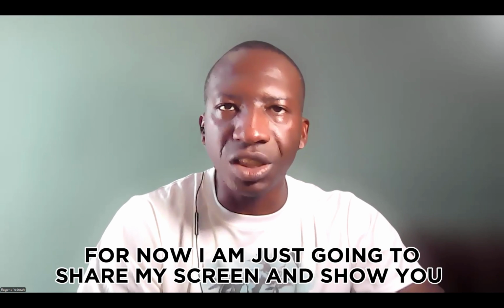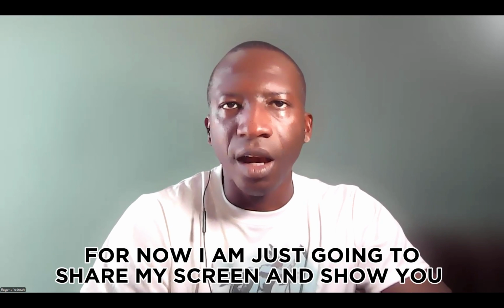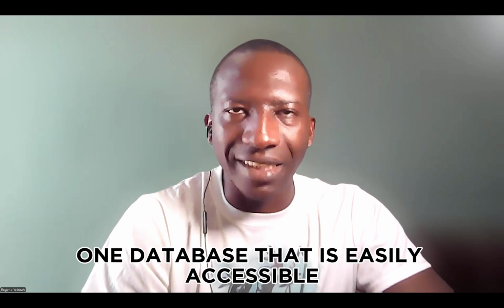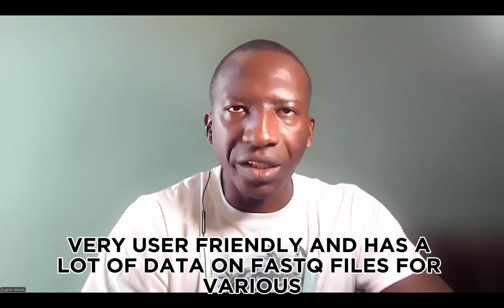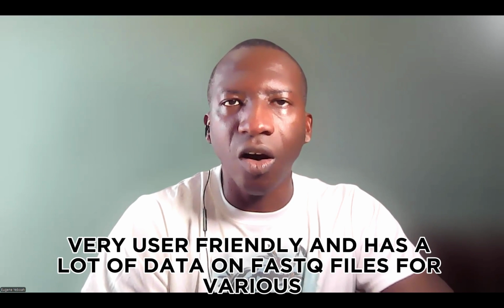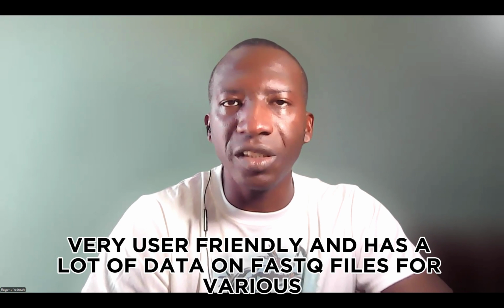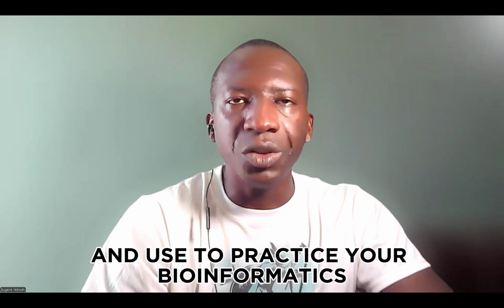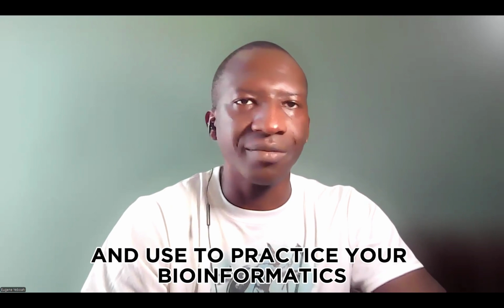For now, I'm just going to share my screen and show you one database that is easily accessible, very user-friendly, and has a lot of data on fastq files for various sequencing instruments that you can download and use to practice your bioinformatics.